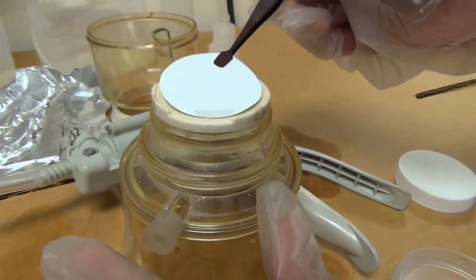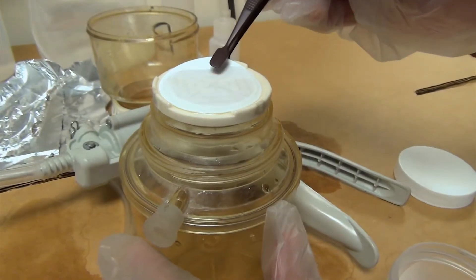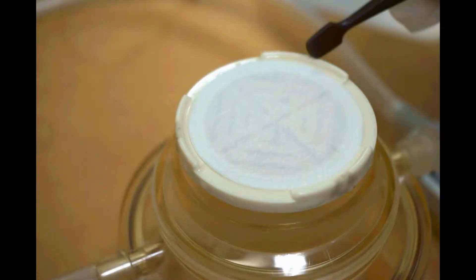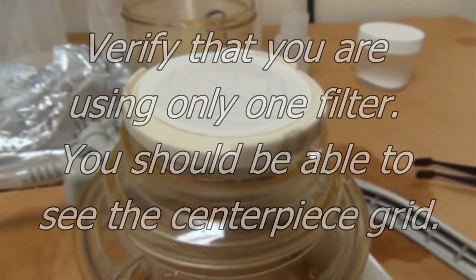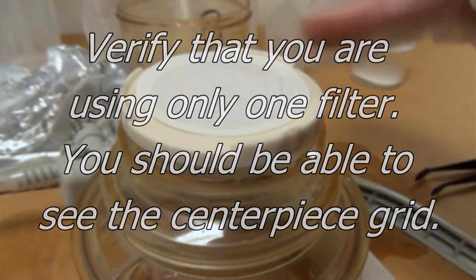You'll notice that the filter will quickly settle into the center piece. Before taking the next step, make sure that you have a single filter. The way to verify this is to look straight down on the center piece — if you can see the grids, you have a single filter. If you can't see the grids, you probably have more than one filter and will need to remove the extra.